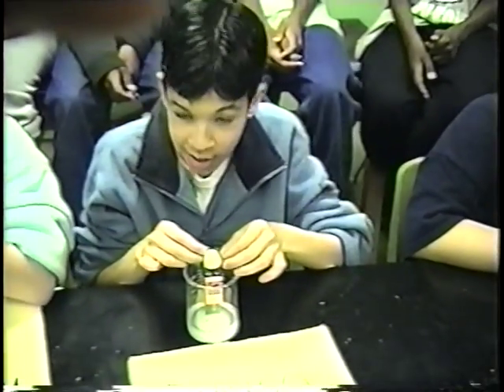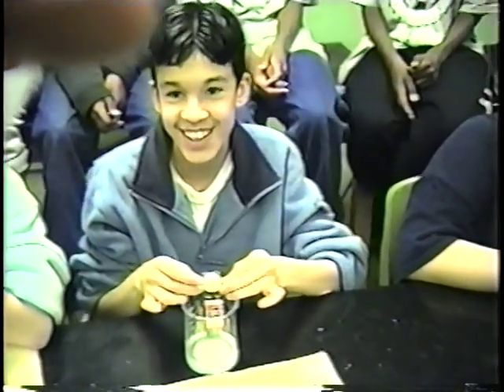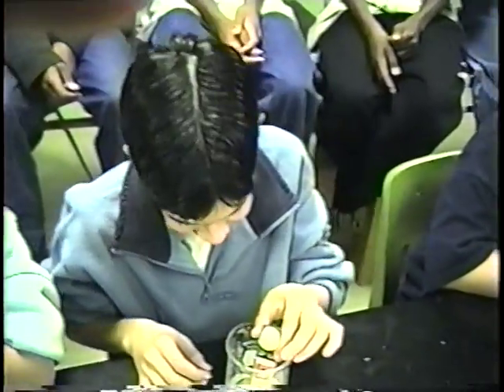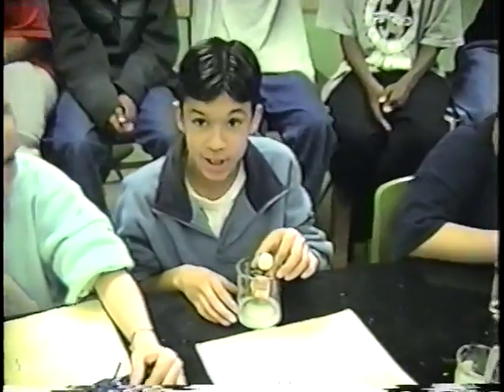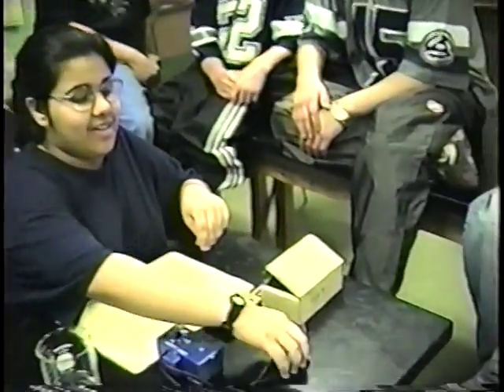Okay, now you're testing out the baking soda, and you got the buzzer. Is it buzzing? Yeah. So that must be you that's making that strange noise then, right? You want to go to the bathroom? So what type of electrolyte is it? Strong electrolyte.